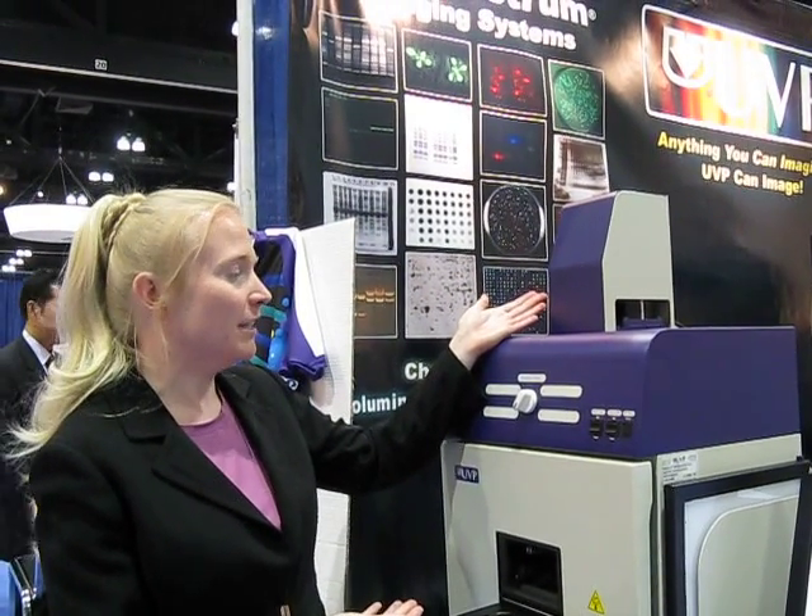You start here with the industry-leading 2.0 megapixel camera. You move down to the emission filter wheel. We have a four-position emission filter wheel.